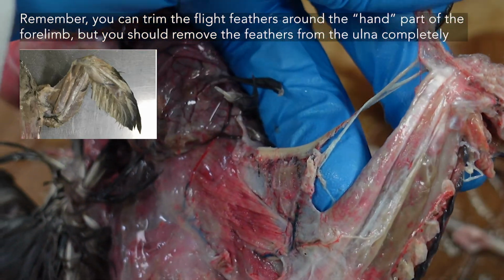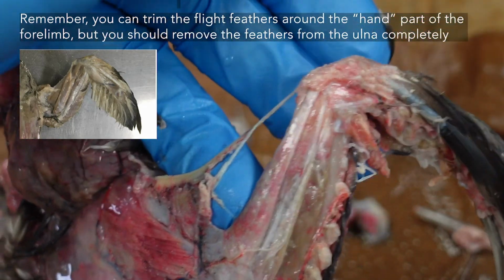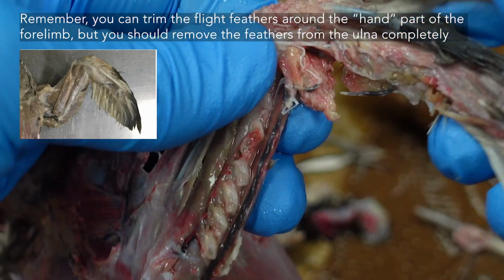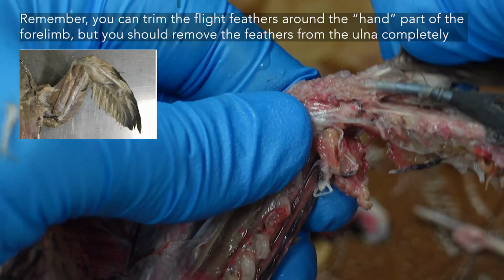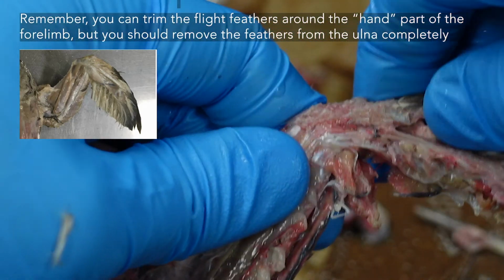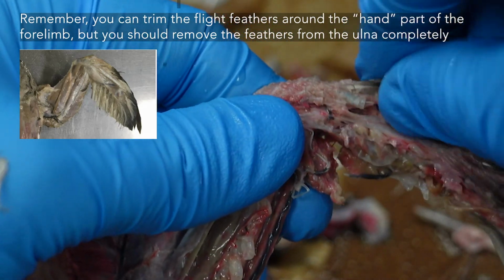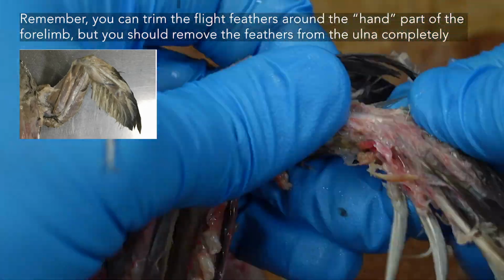I'm just going to trim here. Instead of putting too much pressure on that tendon, I'm just going to trim that skin away so I'm not pulling on it. Lifting your wing feathers here, you can see this is where that thumb is. You see that little thumb? Not this, this is the feather. This is where that thumb of the bird is. So just carefully pull those feathers away so you don't take the bone itself.